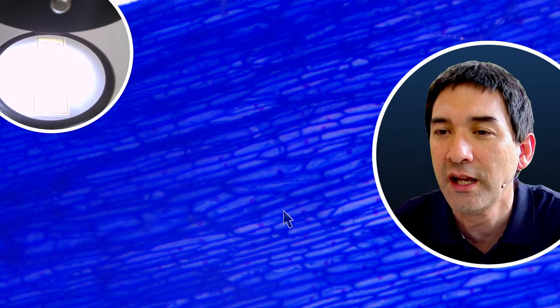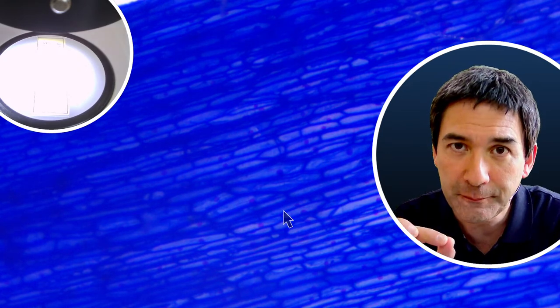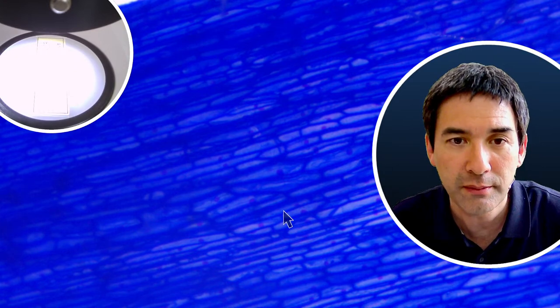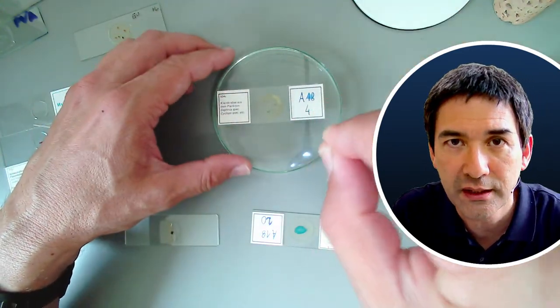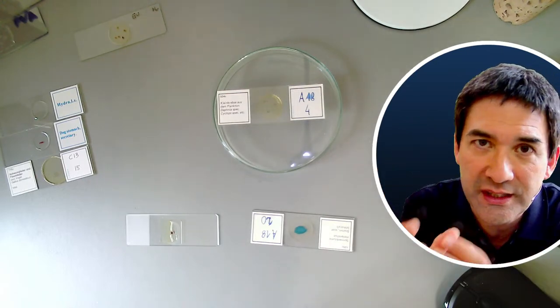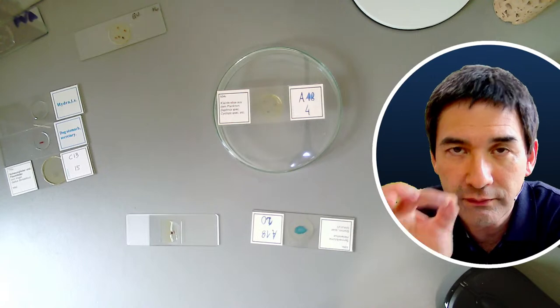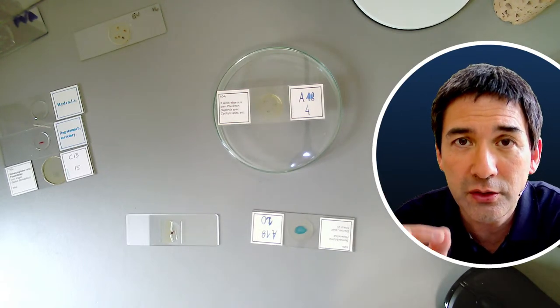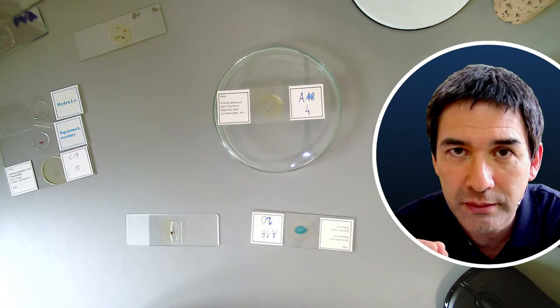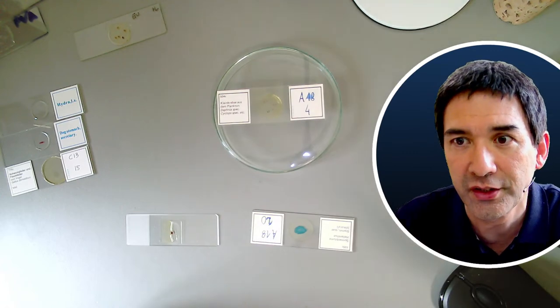A question about arranging butterfly scales: can you suggest an adhesive to hold the scales so the mounting medium doesn't float the arrangement apart? The adhesive honestly is the mounting medium itself. The general problem is: if you place a scale and put the cover glass on top, the cover glass pushes everything away. What I'd suggest is putting a tiny amount of mounting medium on the slide, placing the butterfly scale into it, and allowing it to dry a little so it can't move anymore. Then once dried, add the remaining mounting medium.